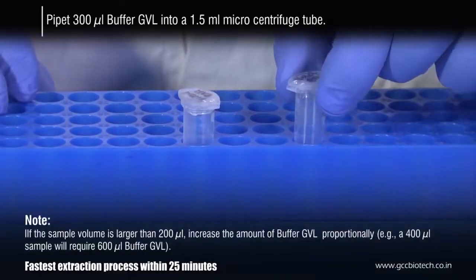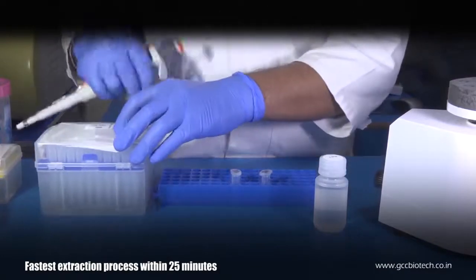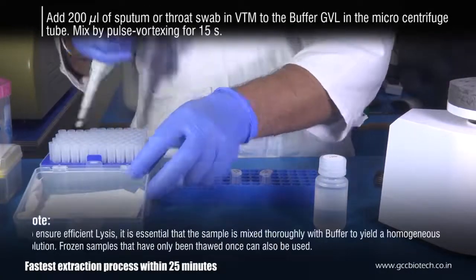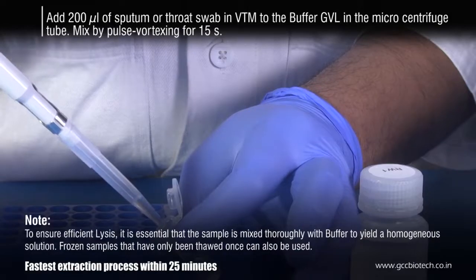Pipette out 300 microliters of buffer GVL in a 1.5 ml microcentrifuge tube. Add 200 microliters of sputum or throat swab to it. Mix by pulse vortexing for 15 seconds.